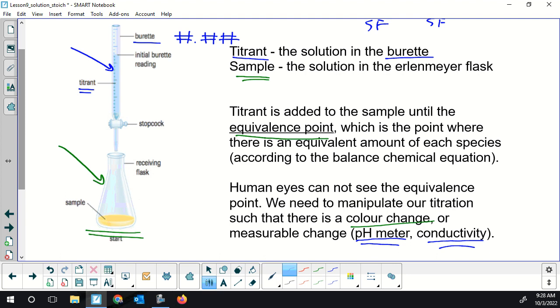They're hard to clean. They're this narrow tube. So in order to clean them, we just rinse the burette with whatever chemical we want to put into it. So we're not going to try to fill it with water and put paper towel or anything down the middle. If you're going to put sodium hydroxide in the burette, you're going to run a bunch through it, rinse everything out that could be in it, any contaminants. After you've rinsed maybe 5 mils through, you can fill it up. So we don't clean burettes and then fill them. We put the chemical we want into them.